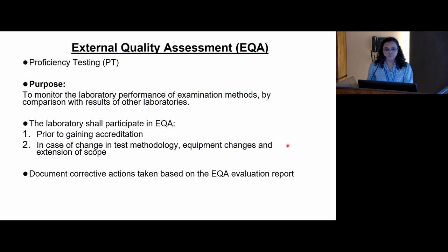So next I will be brief on the external quality assessment. It is also referred to as proficiency testing, and is important to monitor the laboratory performance of examination methods by comparison with results of other laboratories. Laboratories should participate in EQA programs prior to gaining accreditation, in case of change in test methodology, equipment changes, and change of scope. Along with the performance, the documentation of corrective action taken based on the EQA evaluation report is also crucial.